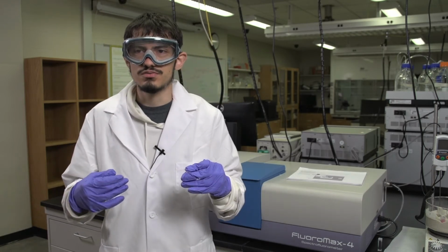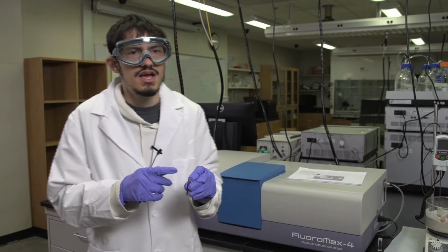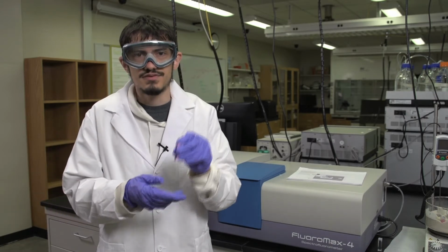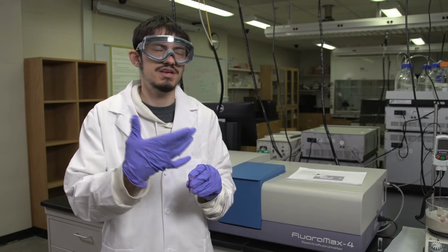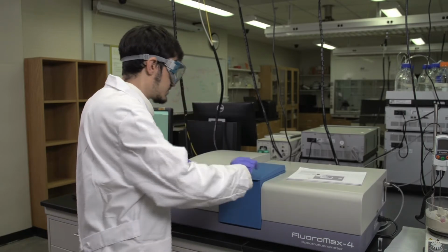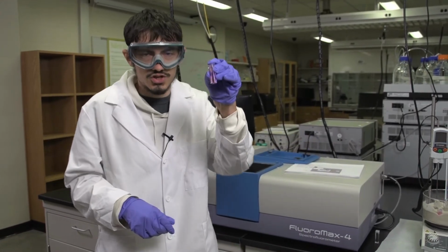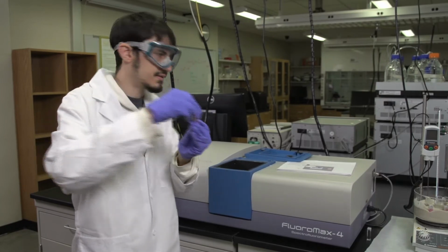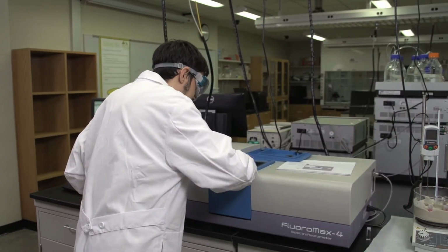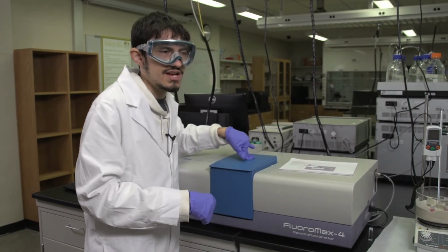In order to investigate this behavior, the first thing to do is obtain an absorption spectrum of the rhodamine dye in order to figure out what the best wavelength is to excite the rhodamine for the fluorescence spectrum. So the first thing to do is take one of your rhodamine solutions, now in a plastic 4-sided cuvette, and place it in the sample holder. Replace the lid securely as before.